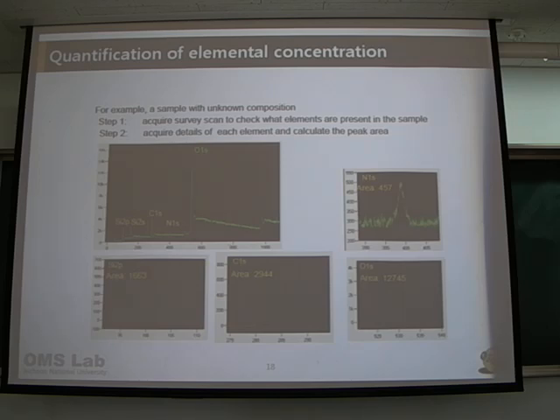So like NMR, because the energy level for the 1s, 2s, depending on the atom, the energy is already determined, known, right? So the energy that we are measuring, like a correlation chart, we can tell. Because in the literature, if it's the same atom, like 1s or p orbital, that will be given. So based on that, we can compare what kind of atom is present in your structure. That means in relation to the energy.